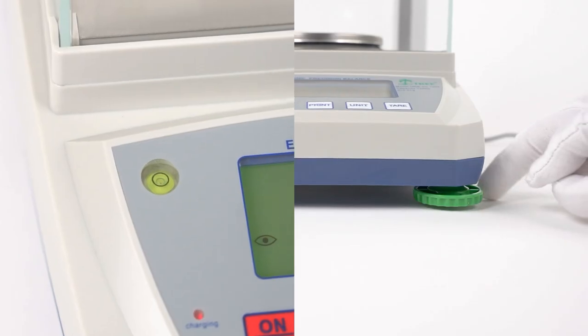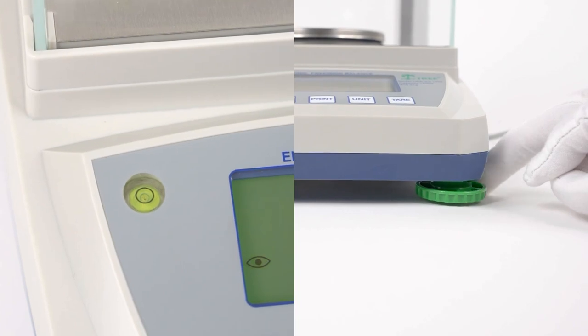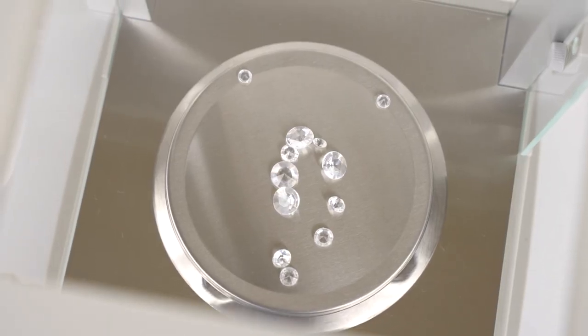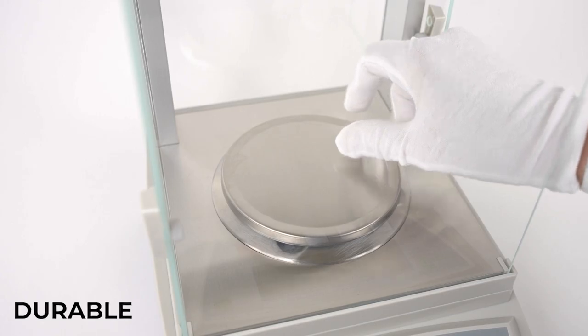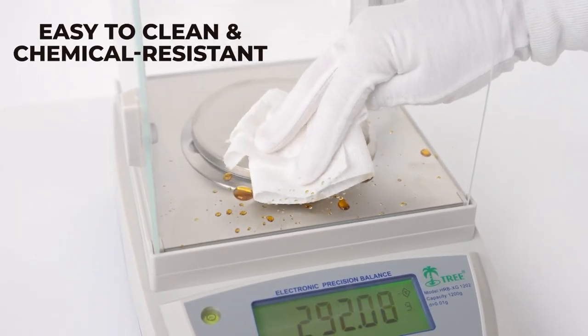Built-in leveling feet and a bubble indicator help you achieve balance in the lab or on your desktop. The stainless steel platter is durable, easy to clean, and chemical resistant.